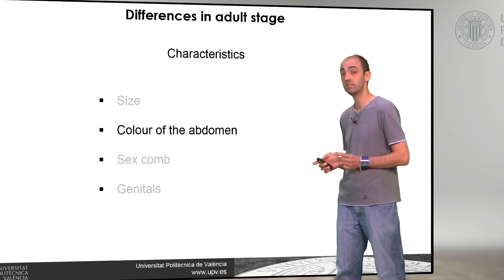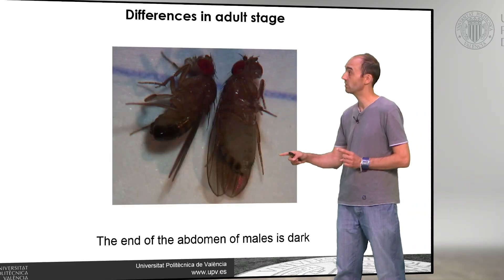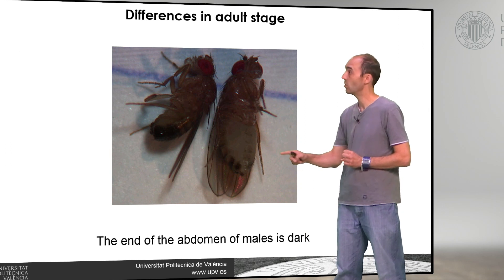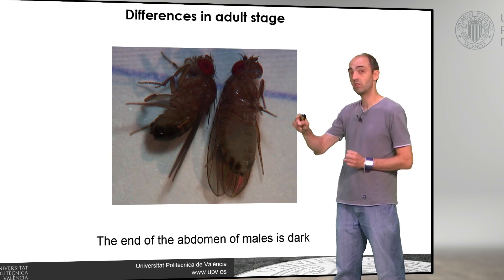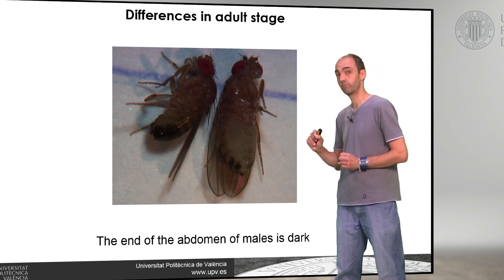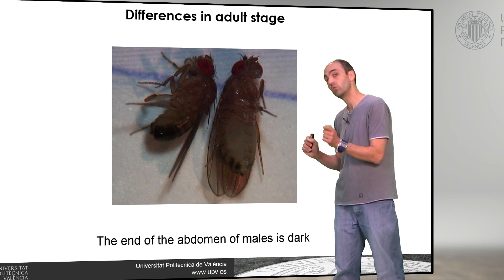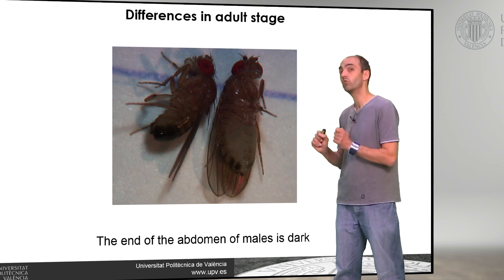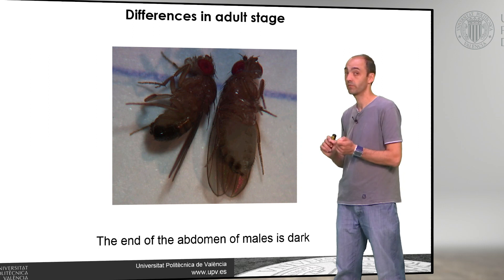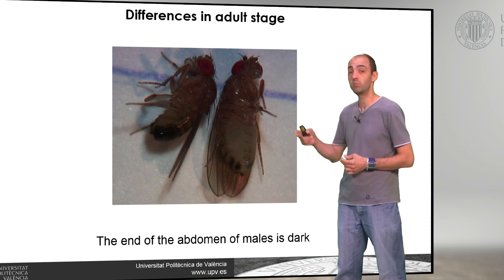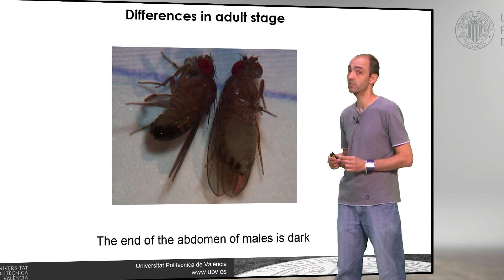The second difference is the color of the abdomen. If we look at the end of the abdomen, in a female it is completely striped, while in a male the end of the abdomen is black. We can use that difference in abdomen color to distinguish a male from a female. Sometimes it is impossible because there are mutants that are completely black, so in that case we cannot use this difference.